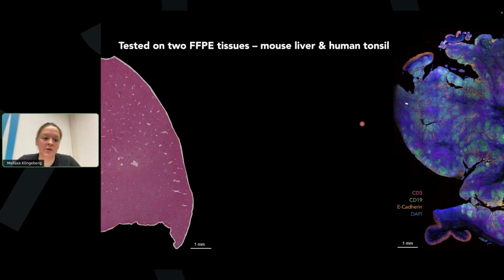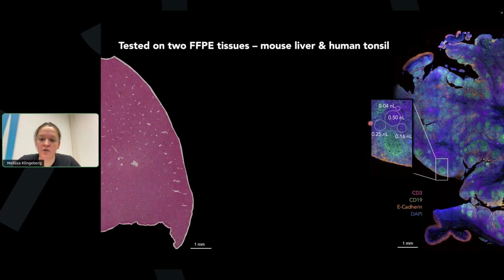We chose those tissues because they are highly structured. So when we look into the architecture, you can select a couple of cells from 1 ROI. You need to do 1 cut in the LMD instead of collecting multiple cells. And this is much faster for the benchmarking.